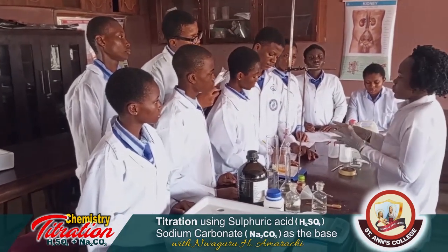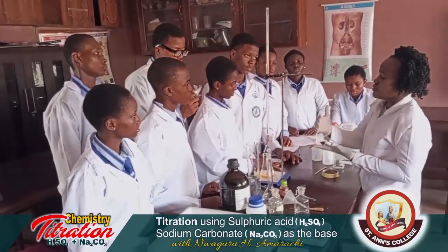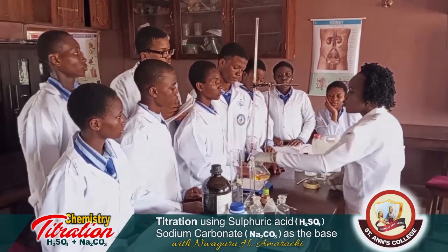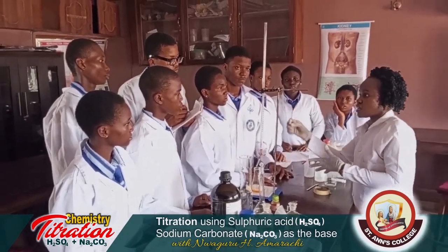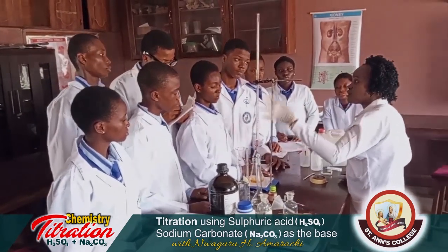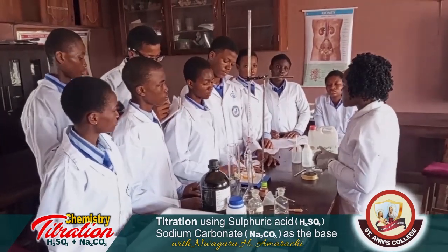What would have been the problem, why the first titration got to 24, is that we didn't observe the color change earlier. So we overused the acid before we could check the color change. The color change had taken place long ago before we observed it.